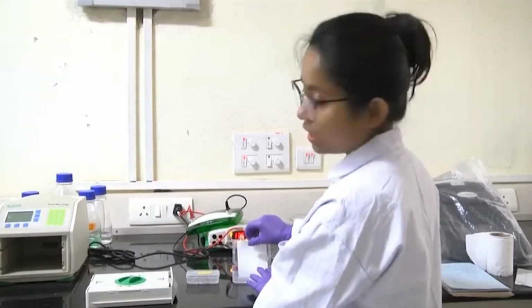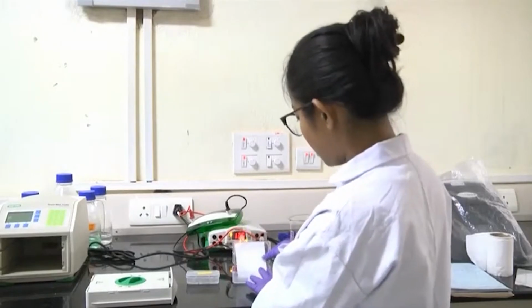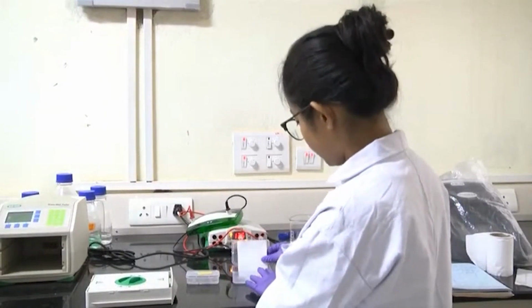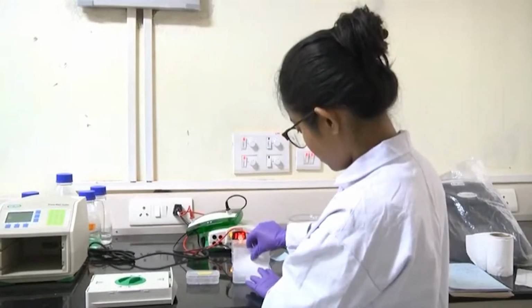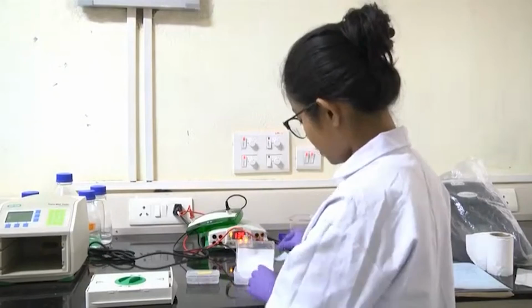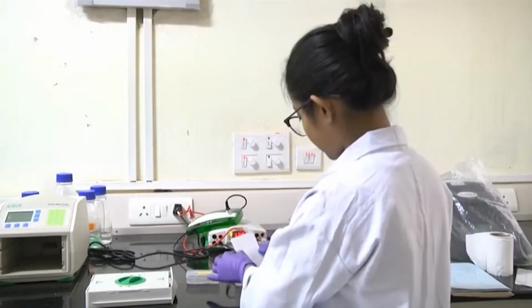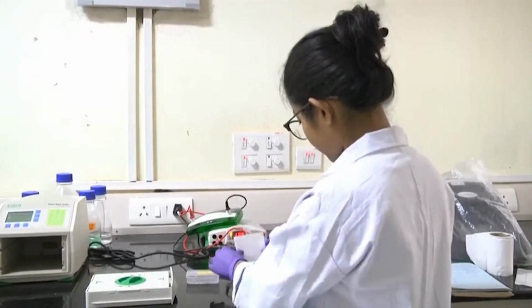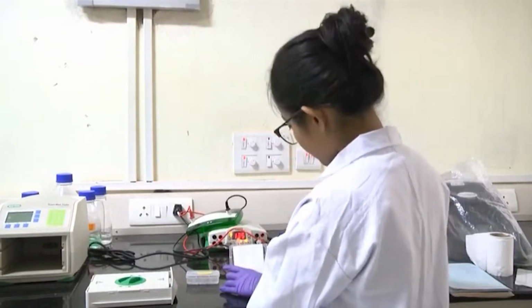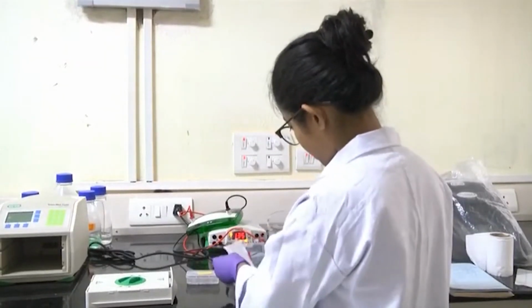Here we do not need the sponge, we just need the soaked blotting paper, and then we will make the sandwich. I will put some amount of this buffer as well.